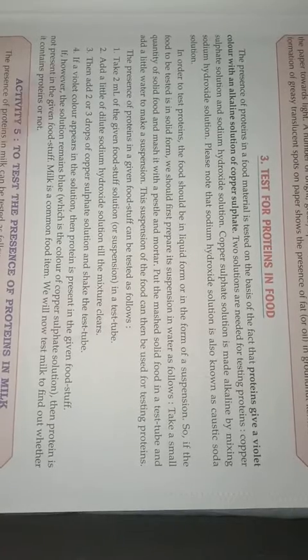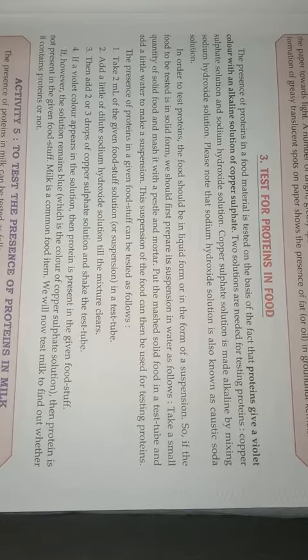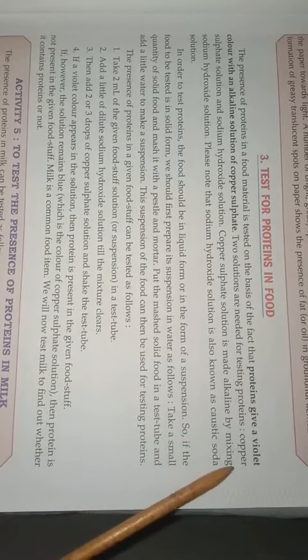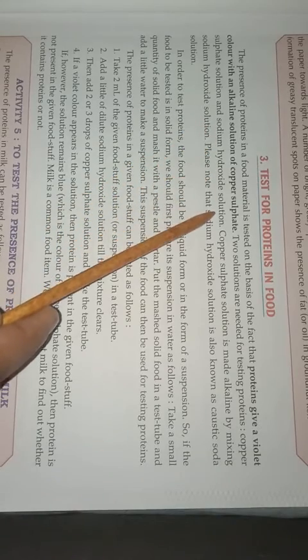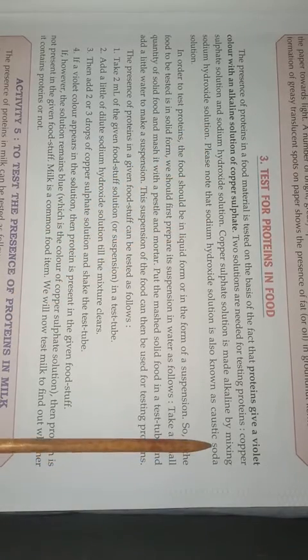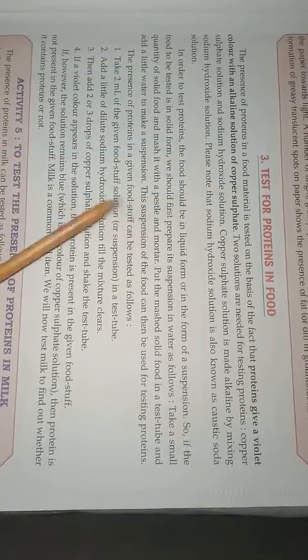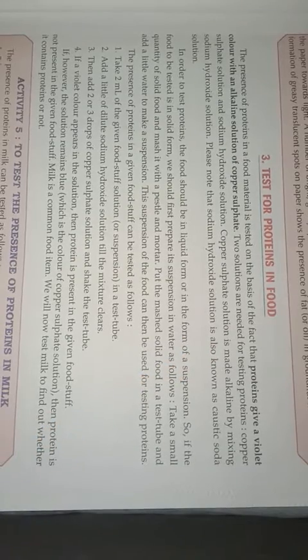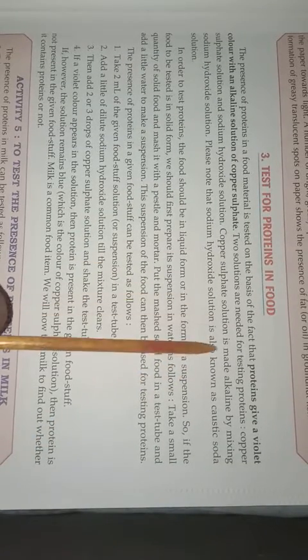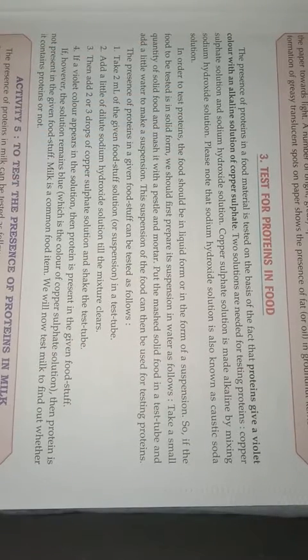Two solutions are needed for testing protein in the food. What are they? Copper sulfate solution and sodium hydroxide solution. The copper sulfate solution is made alkaline by mixing sodium hydroxide solution into it.